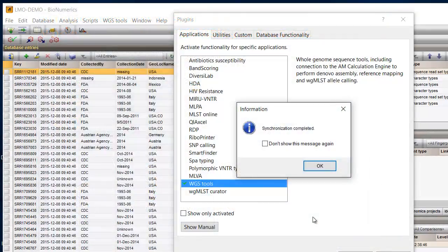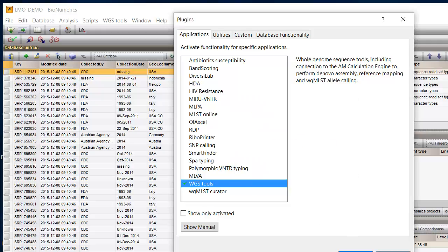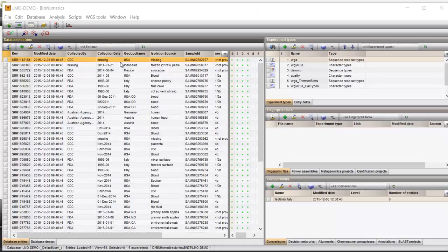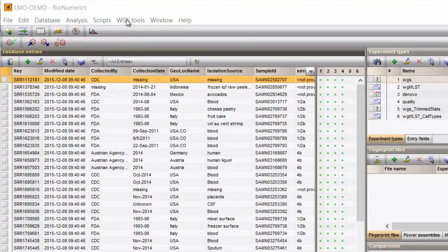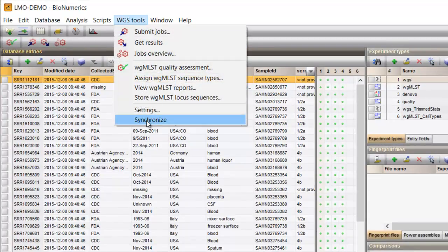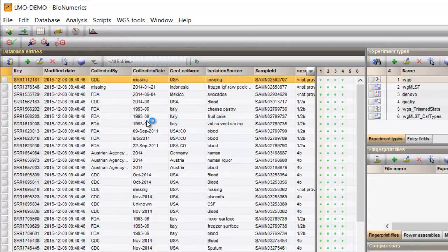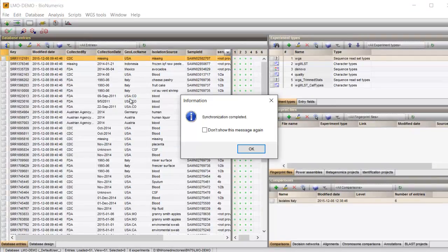Manual synchronization remains possible after installation. You can do so by selecting Whole Genome Sequence Tools, Synchronize. This command will also update loci and typing schemes in case new loci were added.